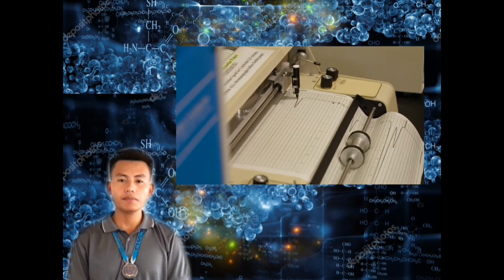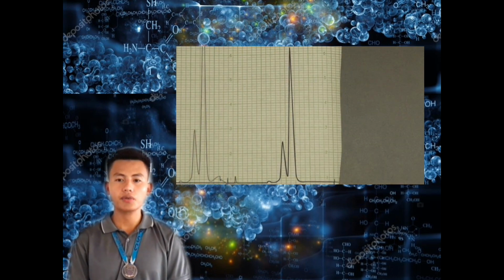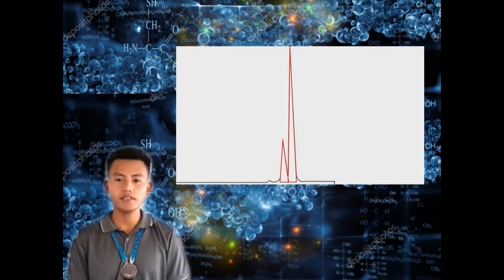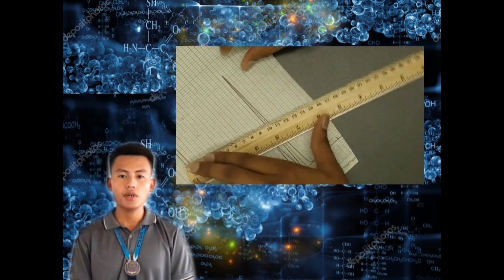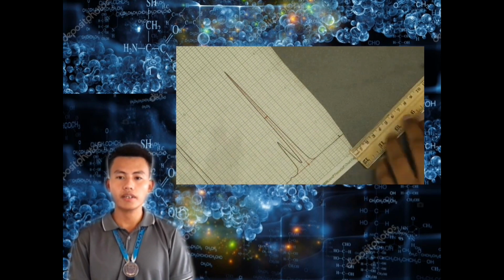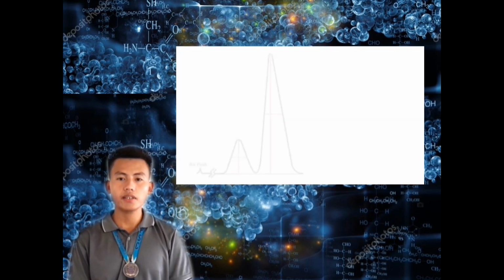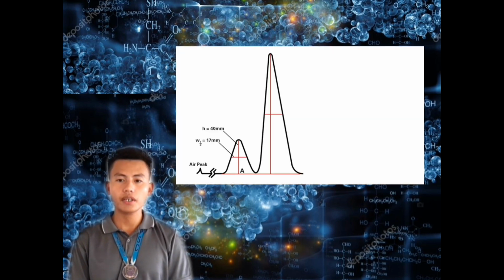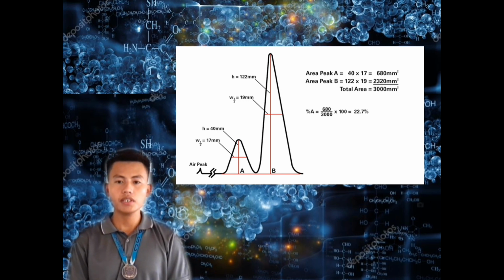HSGC-FID. The bioactive compound released from SLNs containing 2-nonanone and 2-tridecanone was measured using HSGC-FID. Release curves were performed for 72 hours and triplicate aliquots for each formulation were measured and diluted in hexane. Samples were heated and injected into GC-FID for quantification. The analyses were performed using a BPX5 capillary column and external calibration curves with commercial standards.